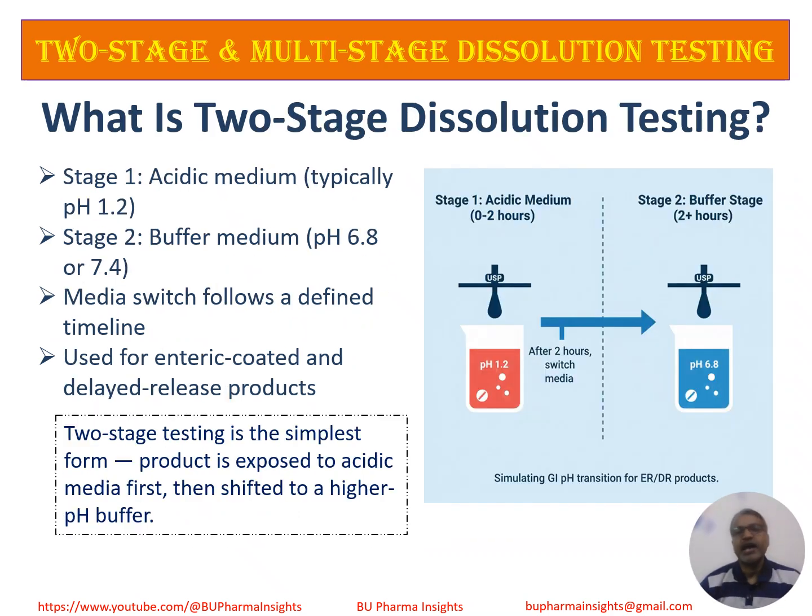The 2-hour exposure in acidic media is not arbitrary. It aligns with gastric residence time recommendations in USP and FDA guidance. This reflects how long a dosage form typically remains in the stomach before moving to the intestine.